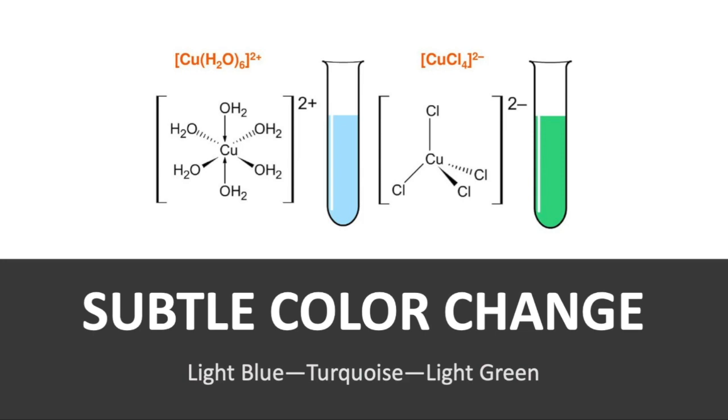I recommend having a piece of white paper or something that you can hold it up to and having good lighting to make sure that you can see the difference. And of course, if you're colorblind, get some help from a friend.